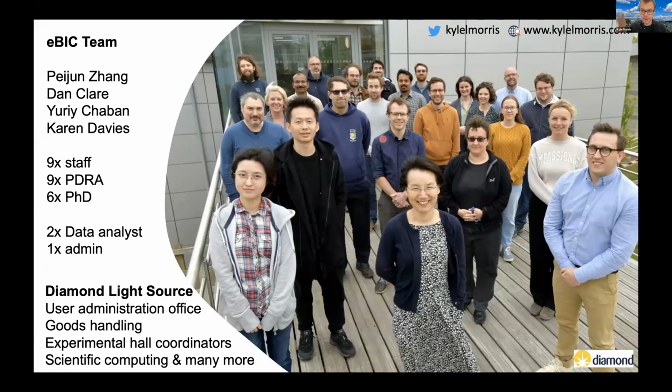So I start with some thanks as well. eBIC is a huge team, actually. We run four pretty big cryo-EM instruments, more than this at a base level, all year round, running overnight for all the experiments. And there's a very large team making that happen in a user facility context.